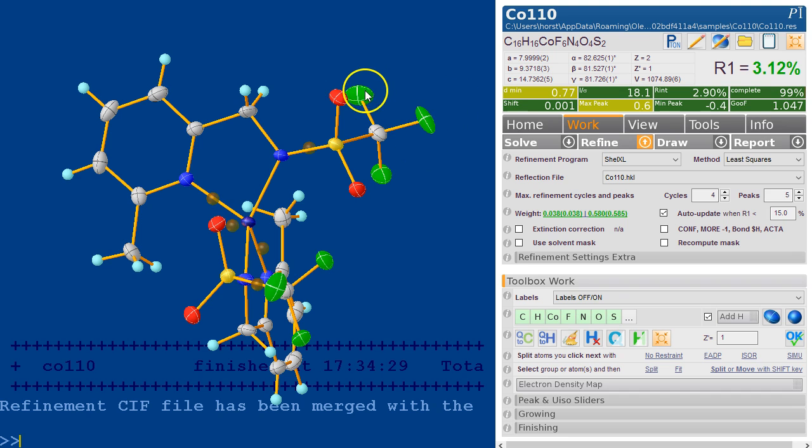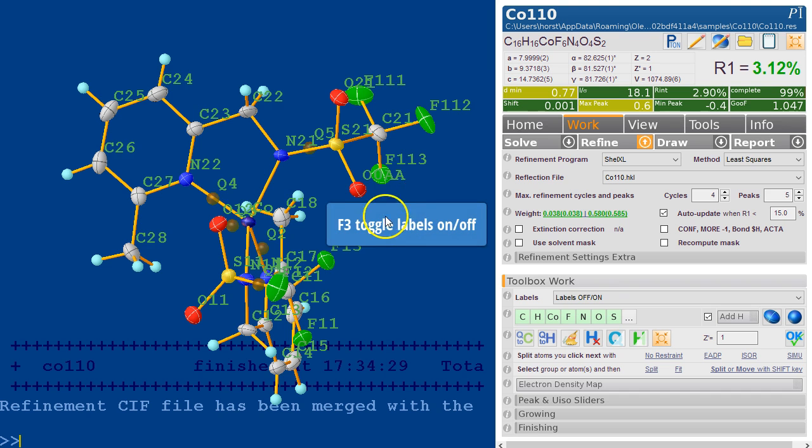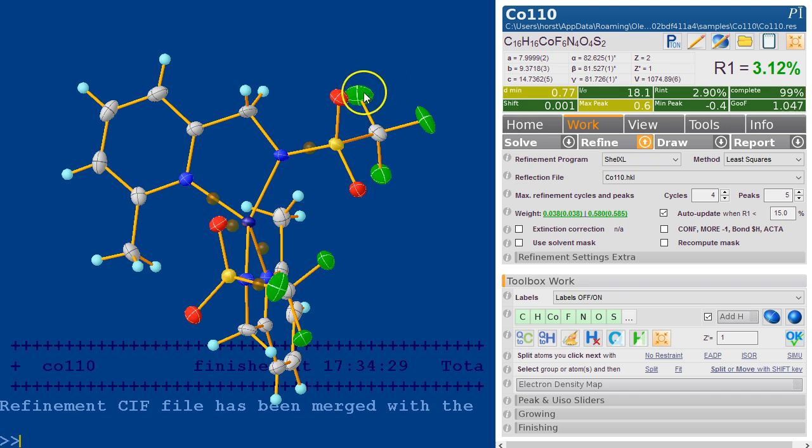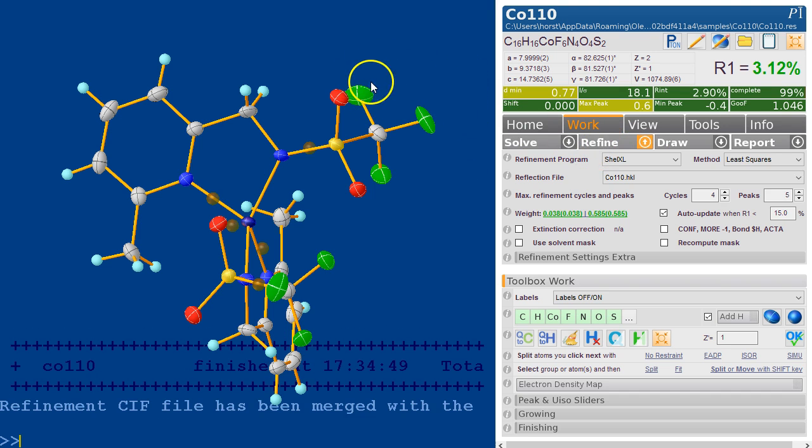If you now rename these atoms here, we select some of those and we type name, I don't know, 111. F3 toggles the thing. So this is F111, 112, 113. And if you refine this, the restraints will stay in place just the same.